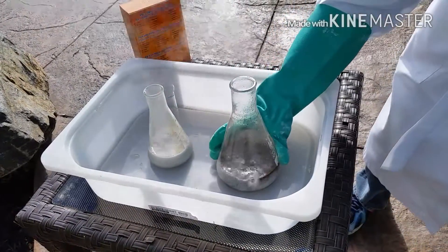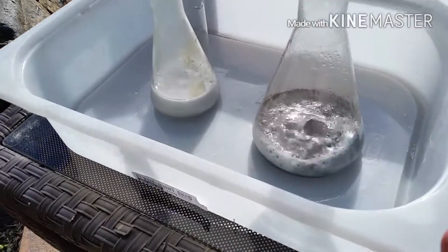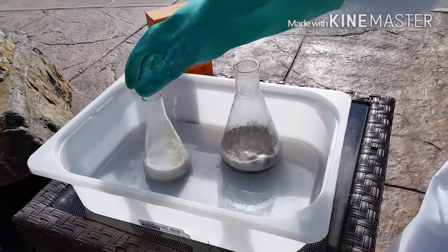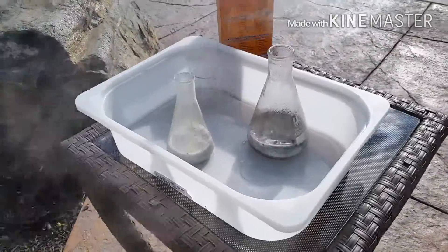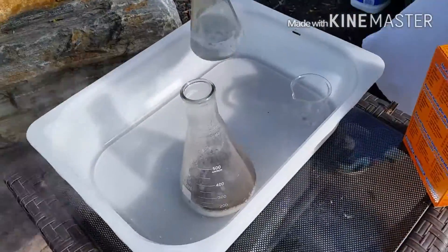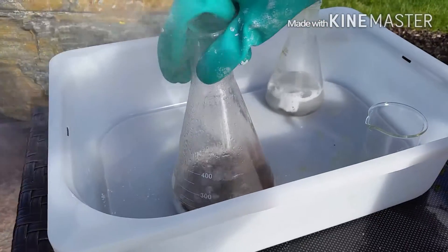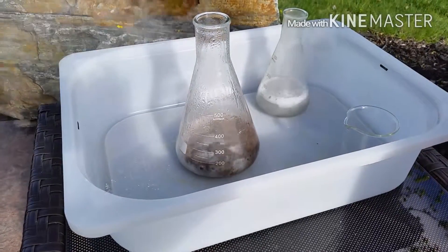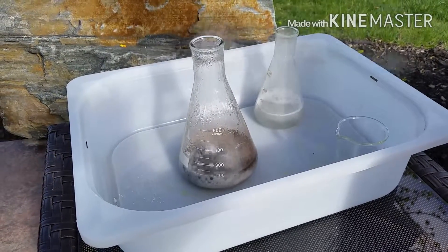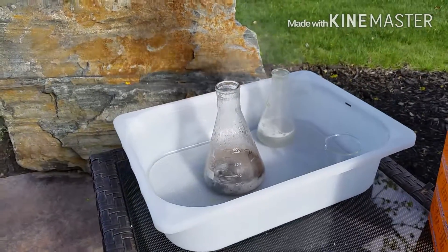How hot does it feel? This one's definitely hotter. Go ahead and move them so we don't burn the table underneath. Don't breathe it in — it smells bad. Don't use a small glass because the bubbles will shoot out of it and you don't want hydrochloric acid everywhere.